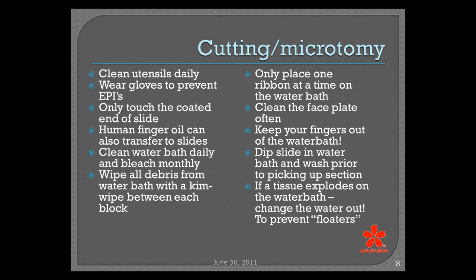We need to prevent those floaters from getting onto the next specimen that we're going to cut. So I see the big breast specimens that come through and they explode on the water bath, and we pick them up as quickly as we can and get the best section that we possibly can, but then we tend to go to the next case and not think about what could potentially still be left in our water bath.